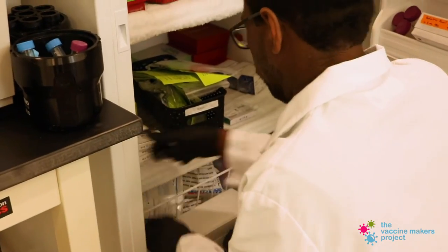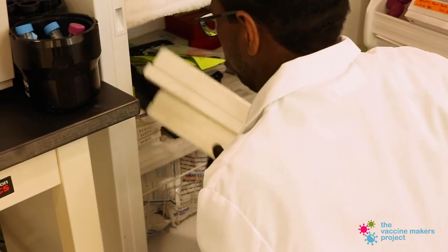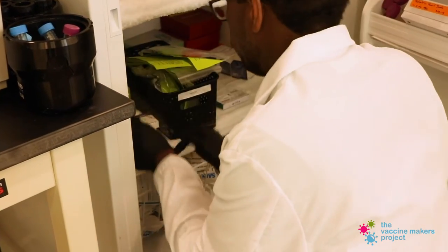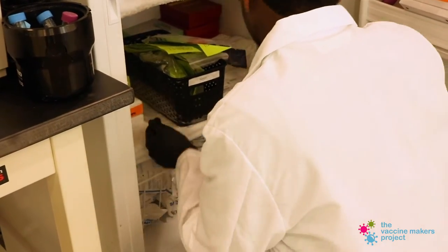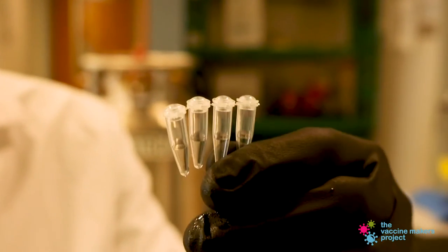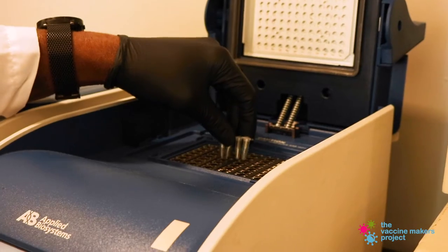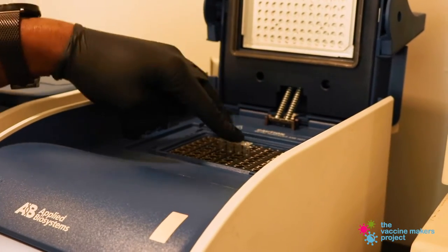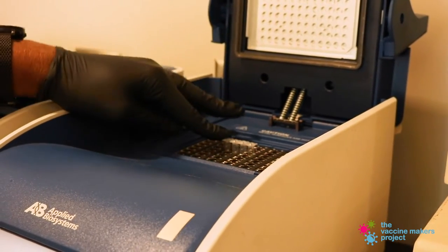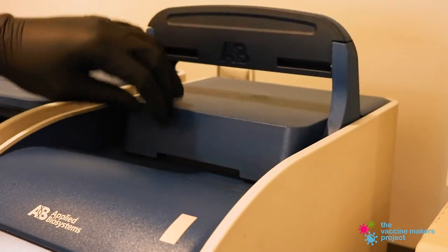I use PCR as well to tell different bacteria apart. Primers are used to bind to specific portions of DNA. You can design a primer that'll enable you to tell different bacterial species apart because different bacteria have different DNA, so you can target sites that you know will be different between species. You can tell which is which by which one amplifies, and I do that a lot. The term for that would be called genotyping.